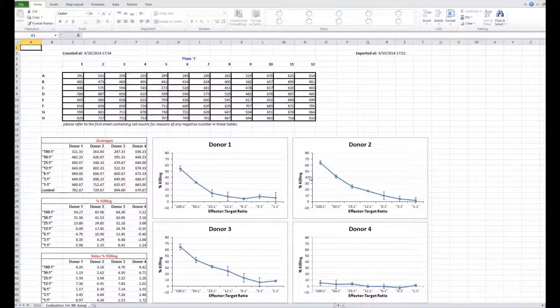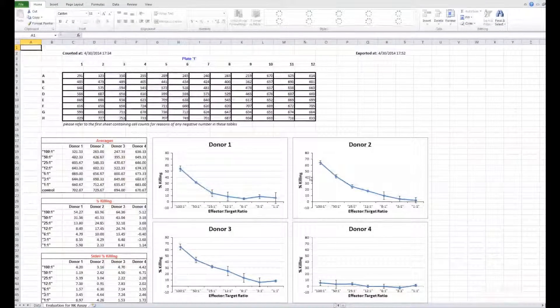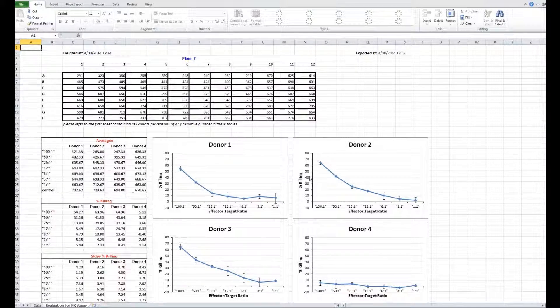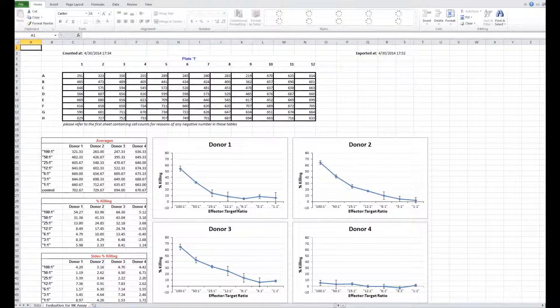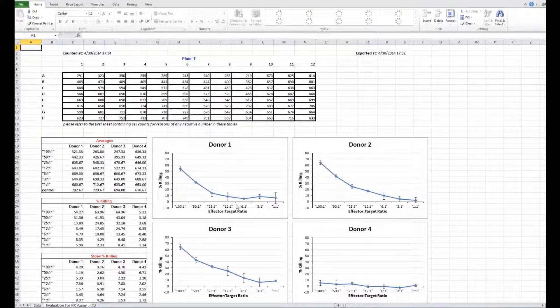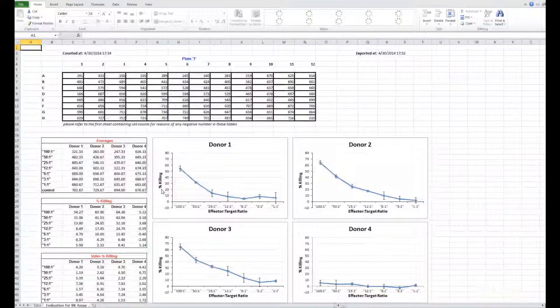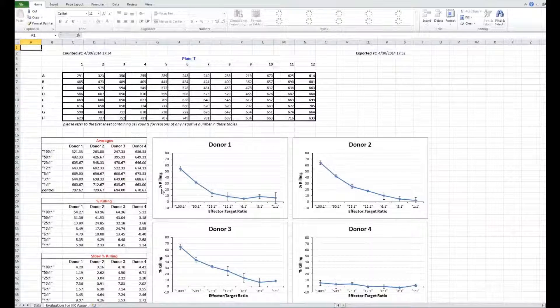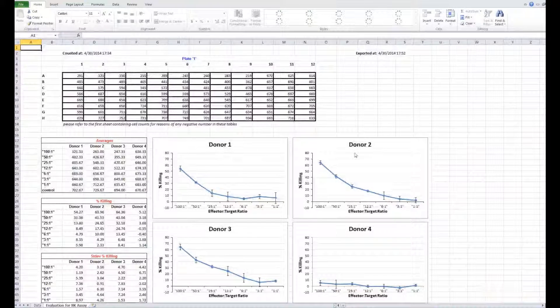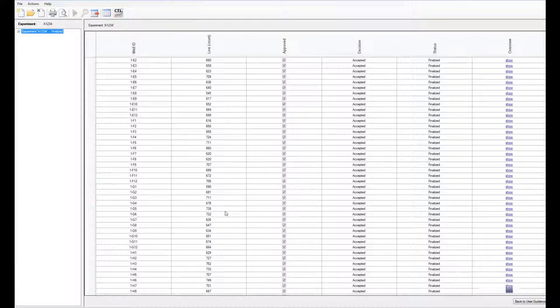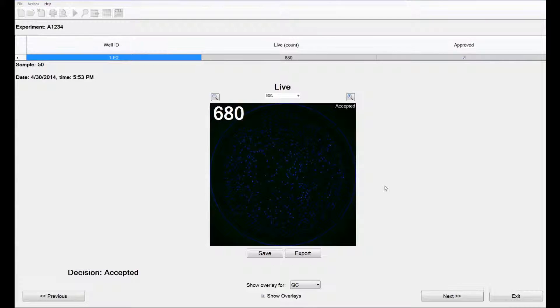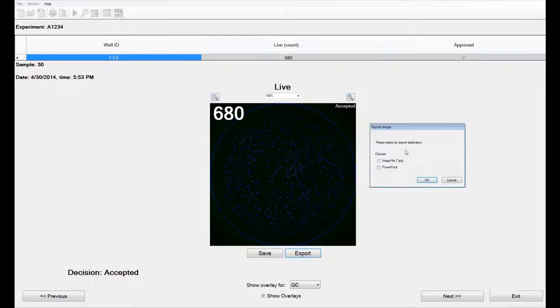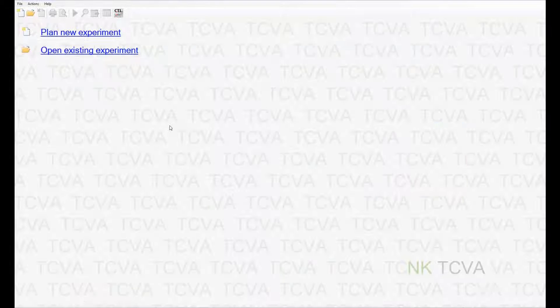The Excel sheet provides the raw data with the specific counts from each well as well as the graphs depicting the percentage of specific lysis or the percentage of killing for each donor that was tested. You can also view the summary table which allows you to see the overview images just as in quality control mode. You can export individual well images either as a JPEG file or to a PowerPoint slide.